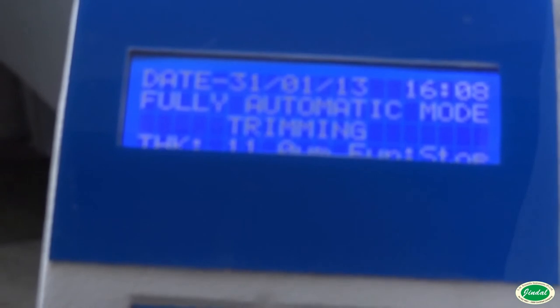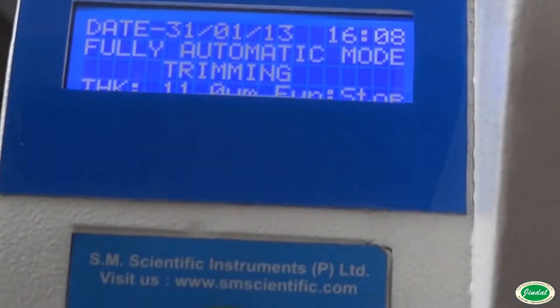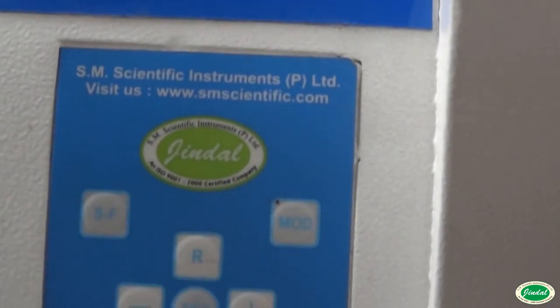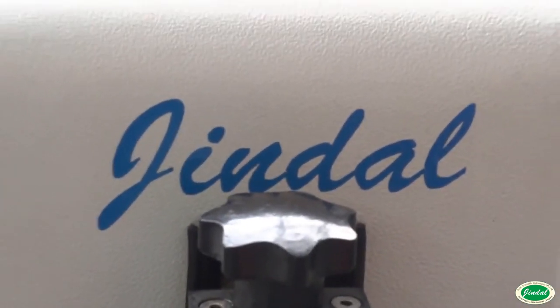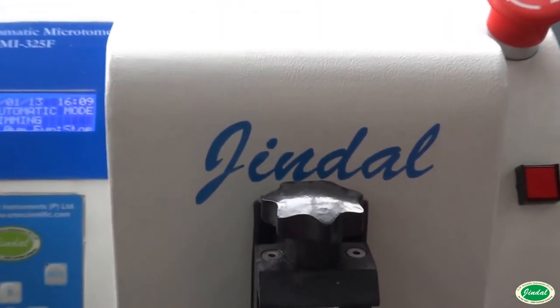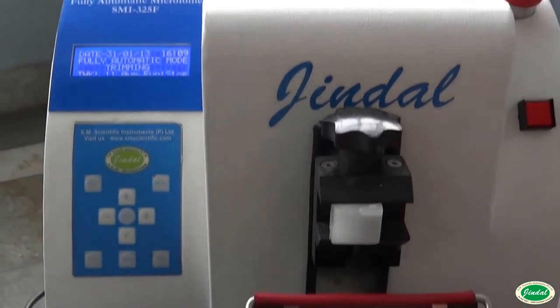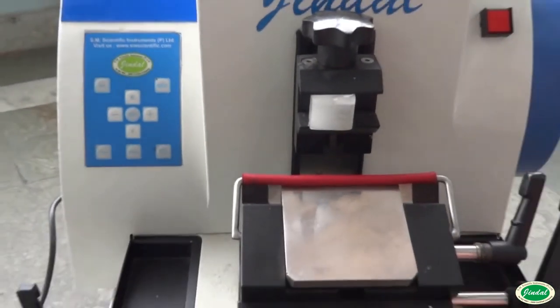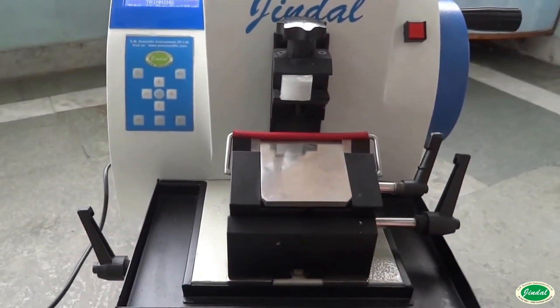Its outstanding technology allows it to be used for semi-thin to thick sectioning of soft or hard specimens, routine as well as special biomedical applications. The fully automatic microtome characterizes a great combination of cost-effective competence and user comfort. It is the instrument of choice for clinical histology and histopathology applications.